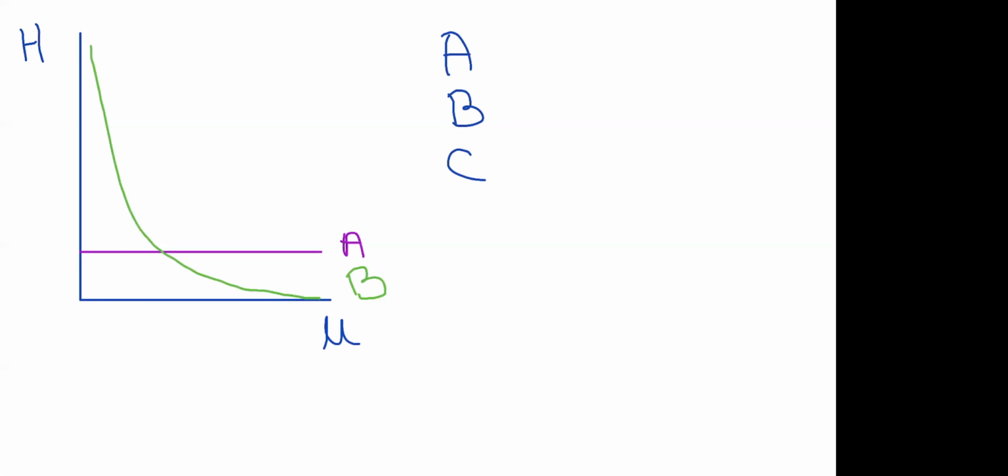And lastly, we also have the impact of the resistance to mass transfer, and this is actually increasing with the flow rate. So why is this so?